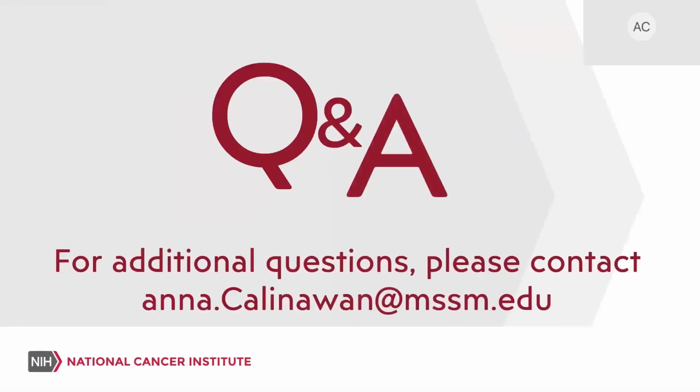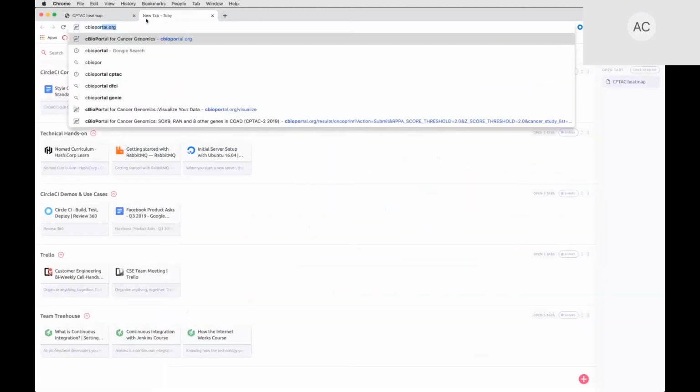We'll now address some frequently asked questions before going to the chat box. So Anna, what are some of the advantages of using Protrack over other heatmap tools? That's a great question, and I think it's a really important one.